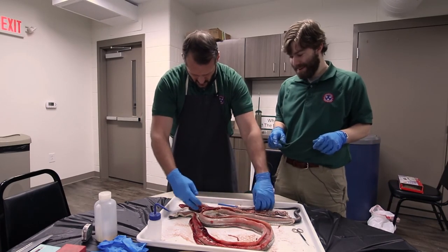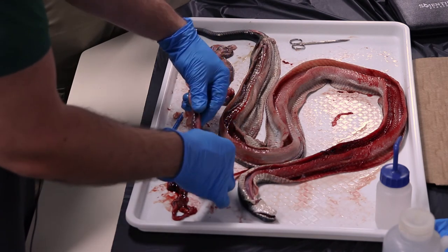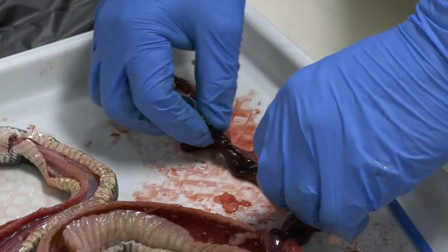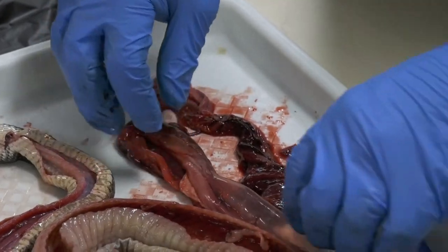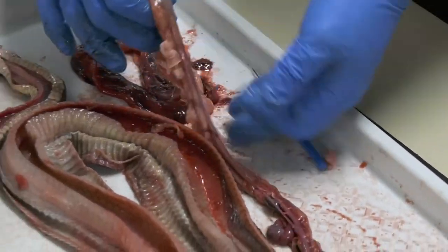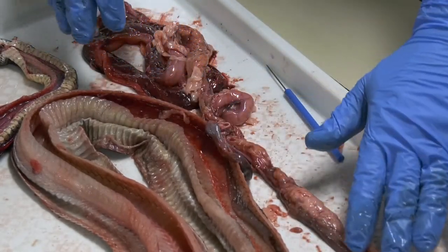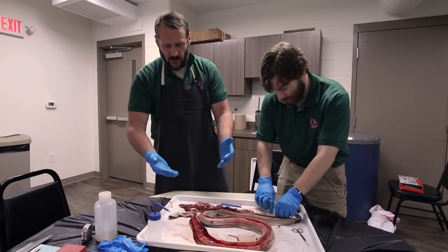All right, so once again, here's our viscera. We've got this right here, which is all mesentery. The coelom cavity of coelomates is oftentimes surrounded by this connective tissue. Ooh, there's all the injured parts. Yeah, you can definitely tell where the injury happened. So there's that three-chambered heart going on down to the stomach. There's at least part of this that is gallbladder, we think. I think that piece right there is the gallbladder. Yep. All the way on down into the large intestine, urogenital system, and then out the other side.